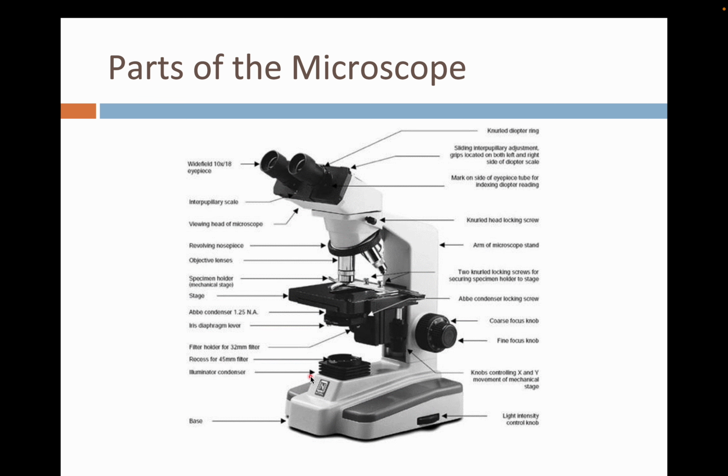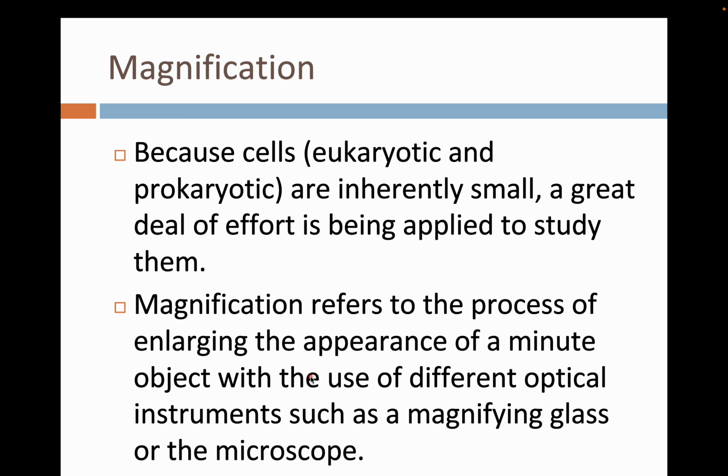So you have to review them on your own. Okay. Now let's discuss some topics in relation to the use of our bright field microscope. So first is magnification.